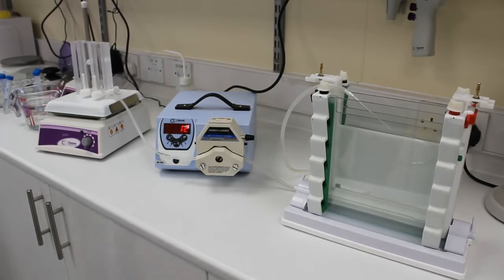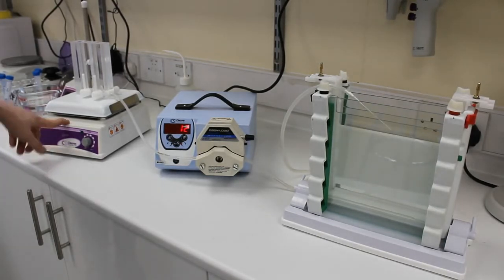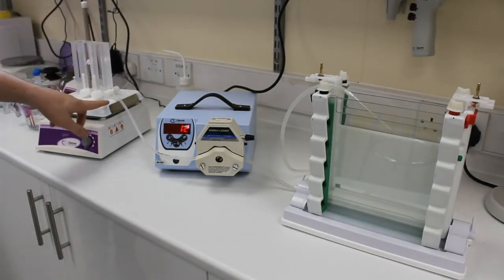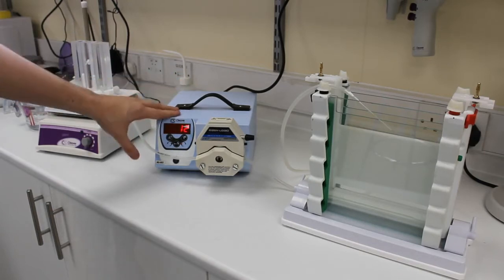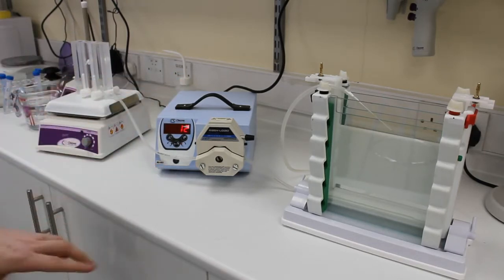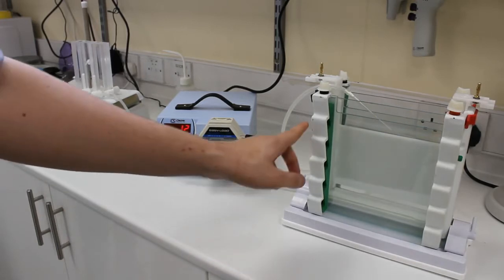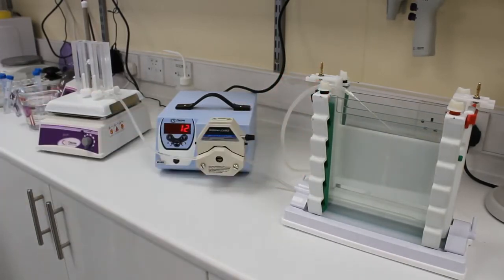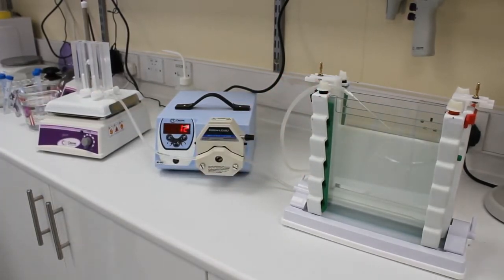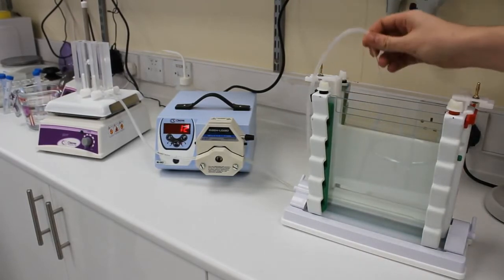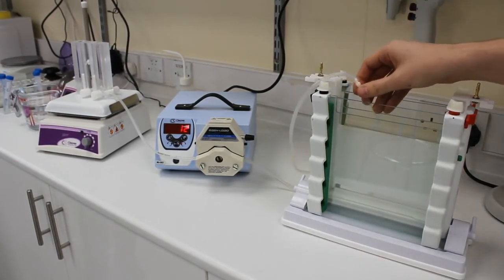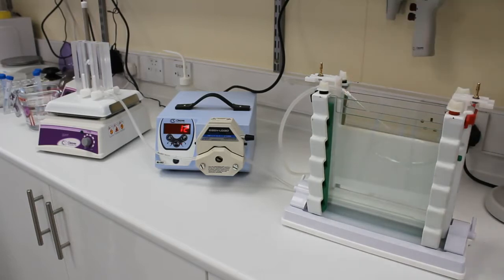So we've got our magnetic stirrer, on top of that we've got a gradient mixer that's connected to a peristaltic pump, this is the model MUD02, and then that's feeding into the casting base with the glass plates. We've got that connected to a gel loading tip which is going to be controlling the flow of gel into the glass plates.